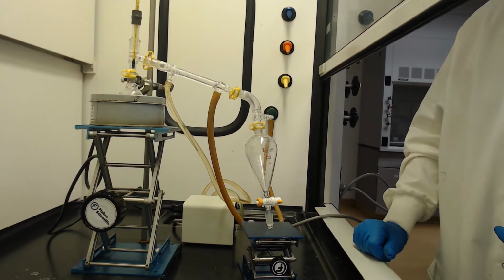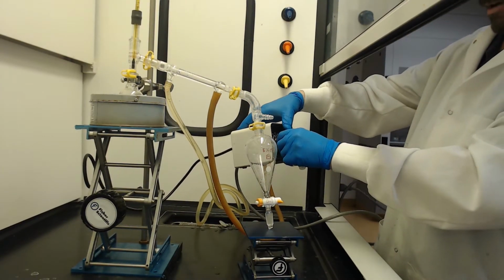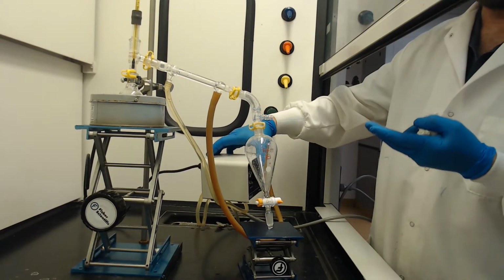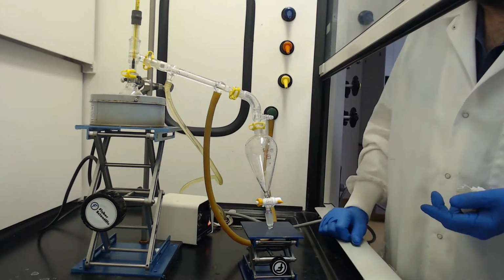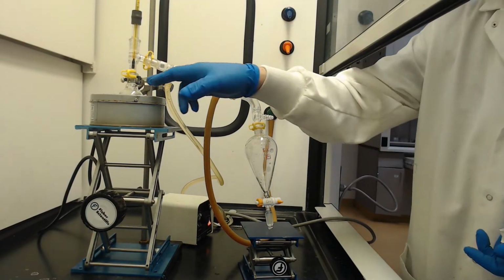Okay, so we've got everything in place. I'm going to turn on my Variac. I'm going to set this at about 40 to start with. We want to keep an eye on it. This isn't water, so it's going to heat up pretty quickly. And we'll just wait for it to heat up. We should start seeing it sweating over here.